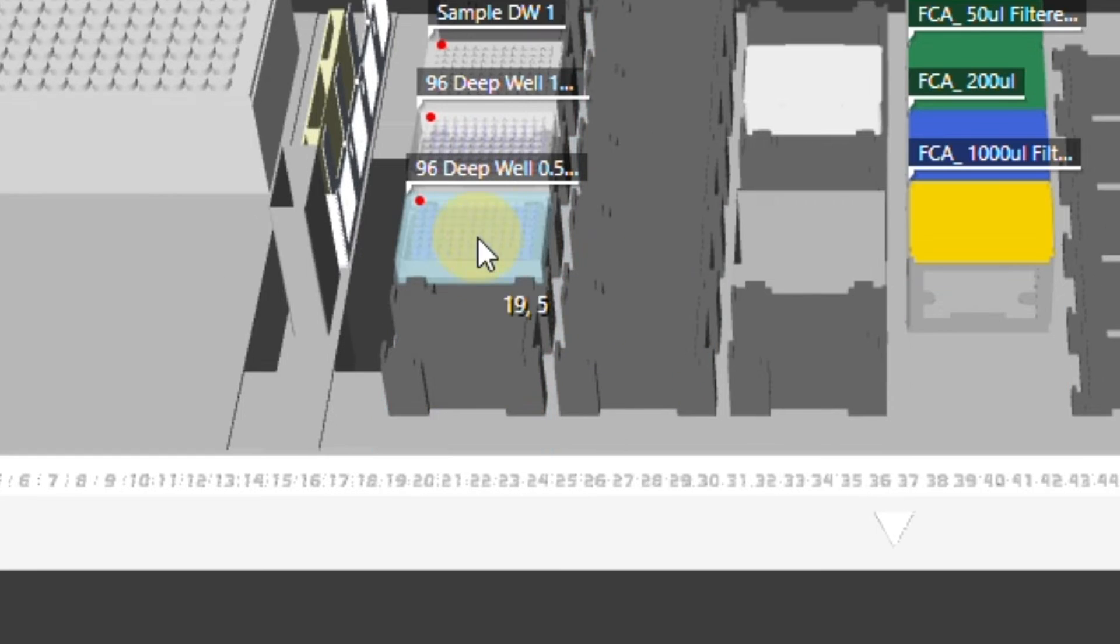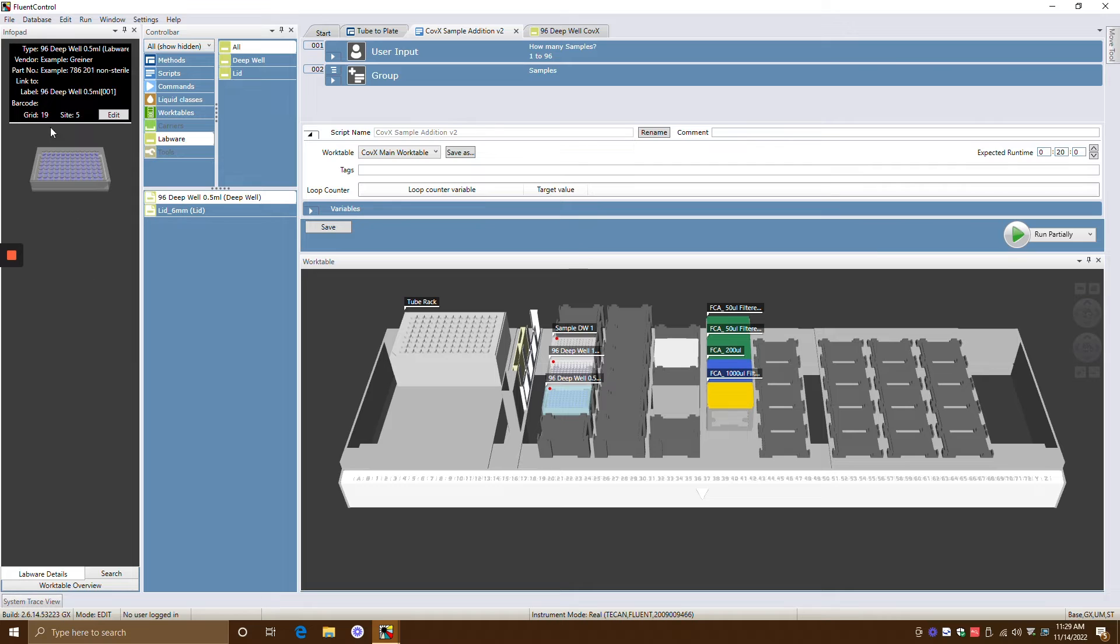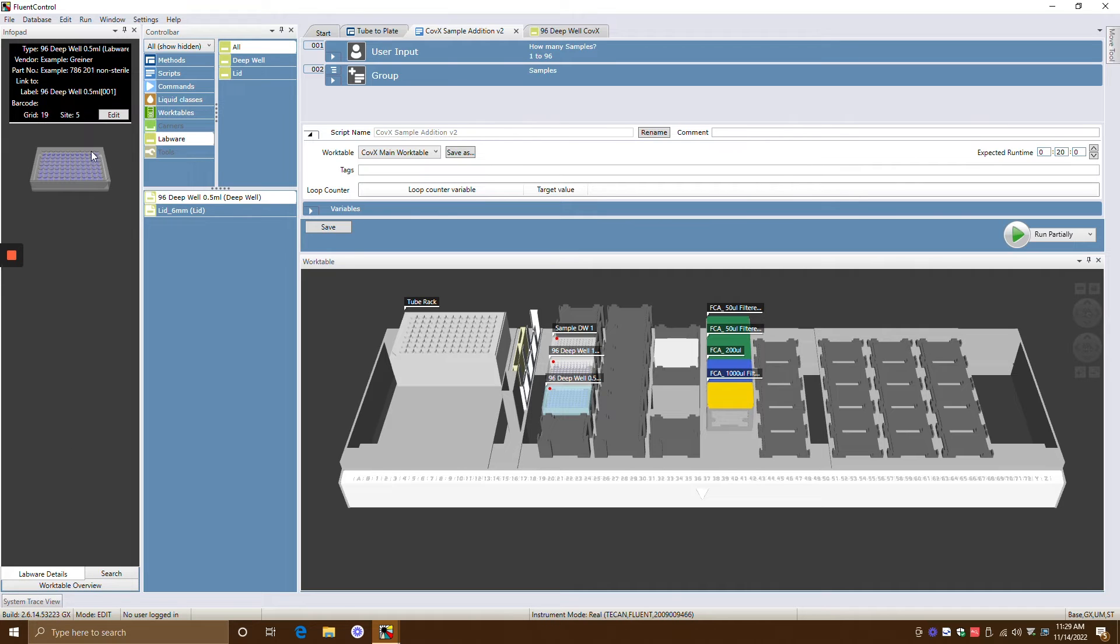So if I click on this labware over here and I click on labware details, you can see this is grid 19, site 5, right? So grid 19, site 5. So you can always click on labware details and understand, okay, what is it that I'm clicking out on exactly?